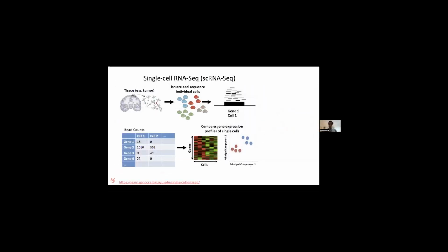Before I go into the details of that, I want to give you a general overview of what happens with single cell data from raw reads all the way to processed data, just so that I can put you in context as to why CELLxGENE is useful and on what steps along this processing of data CELLxGENE is used for.